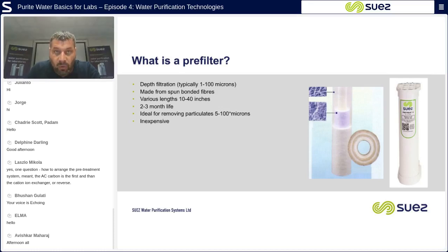For laboratory water purifiers, the depth filter will be part of the pre-filter cartridge makeup. Within a larger central system, it would normally be in a filter bowl. The pre-filter cartridge or filters in the filter bowl will normally be a disposable filter, so a routine will need to be in place to change these on a regular basis, normally every 2 to 3 months.